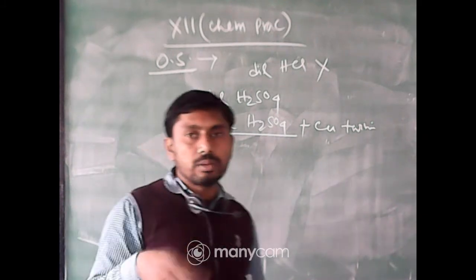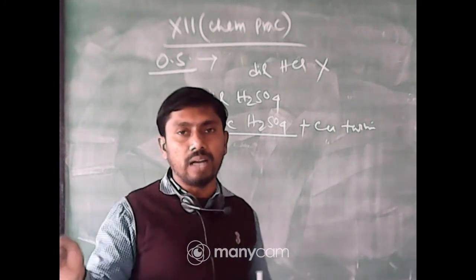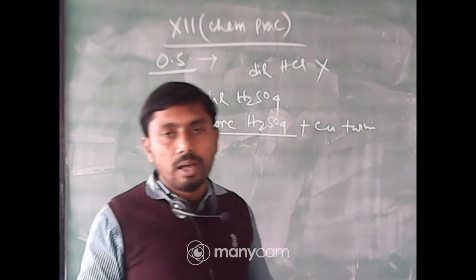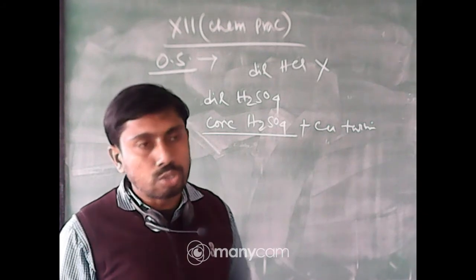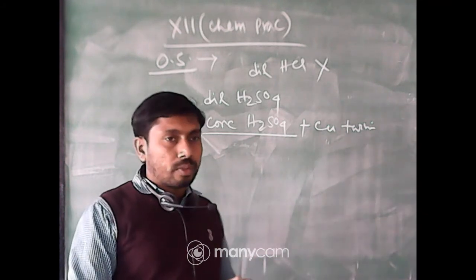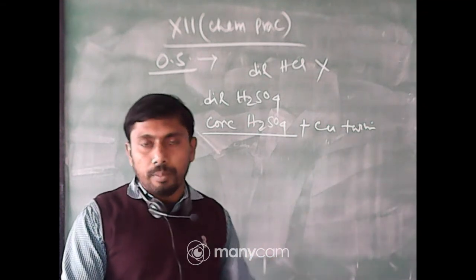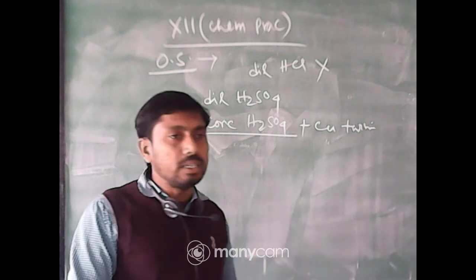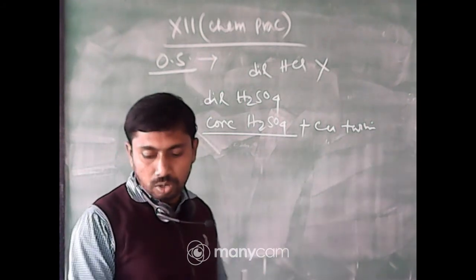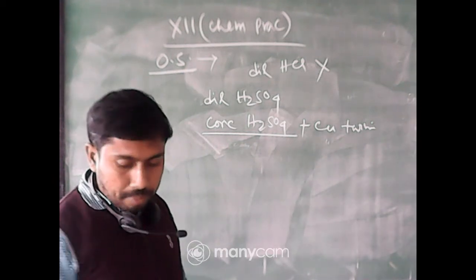This portion is very important because the inferences made after the wet test should be present in the dry test section. Applying your idea, you will present it in the dry experiment section. For simplicity we will make the solution here.